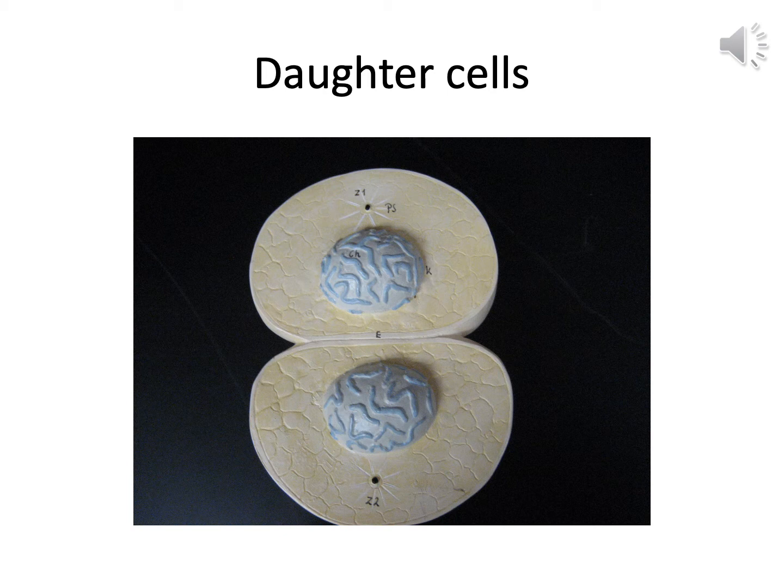They have not quite got their nucleolus back in this picture, and they haven't quite got their nuclear envelope or nuclear membrane back, but you can already see the centrioles are on the sides there. So they're pretty close to being fully fledged daughter cells that just happen to be in interphase beside each other.